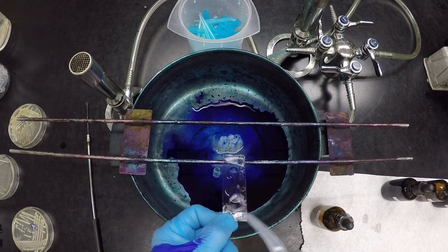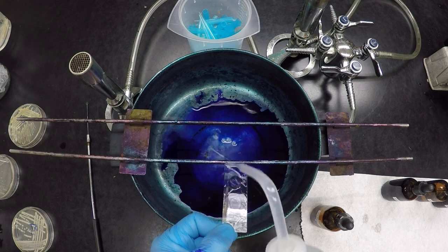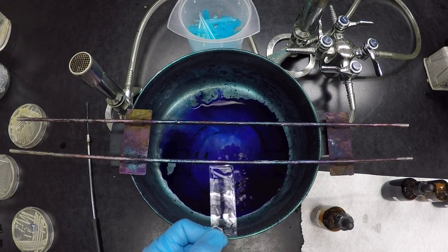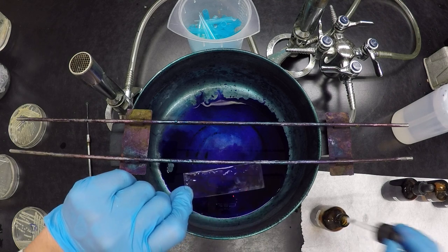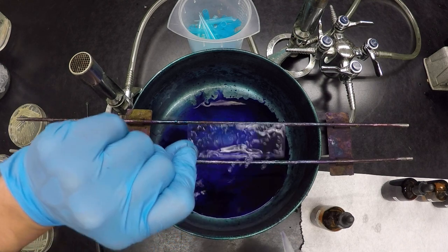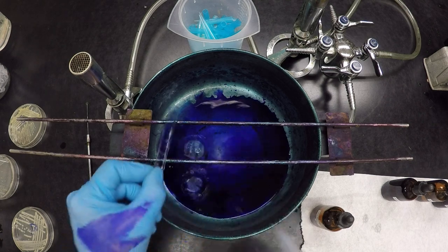Now, you can decolorize too long. If you decolorize too long, you're going to decolorize your gram-positive cells. Of course, if you don't decolorize long enough, you're not going to decolorize your negative cells. And that's why this step is so important. Tap, tap, tap. Oh, and let me show you guys something. Check this out. Do you remember how I said reagents would wipe labels? Well, there we go. Labels are starting to come off. So that's why it's very important to label opposite sides, so then your labels don't come off.